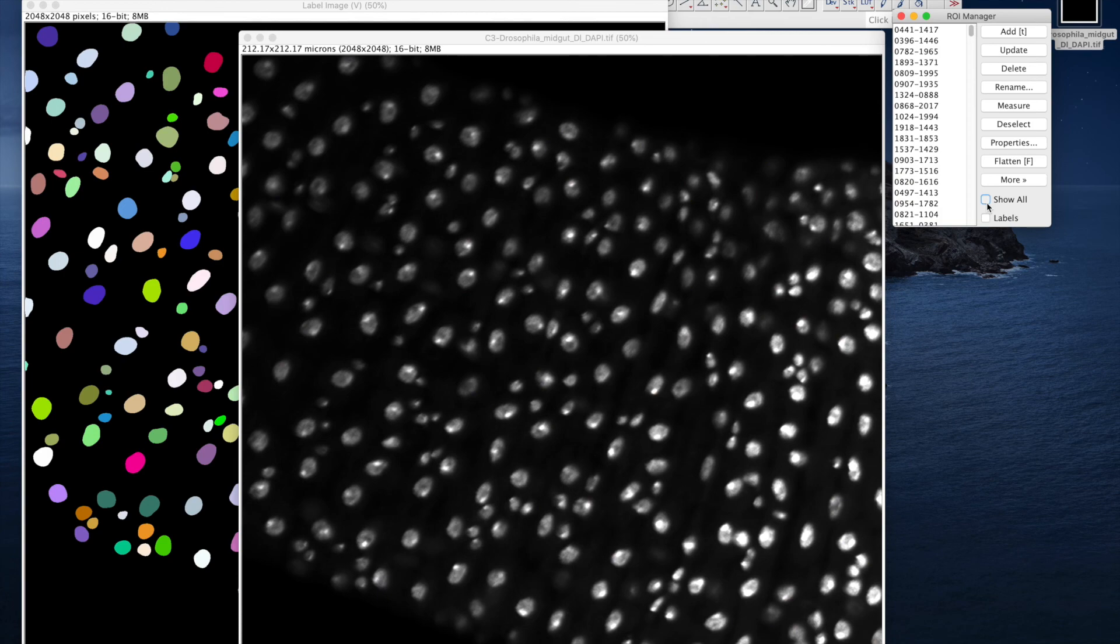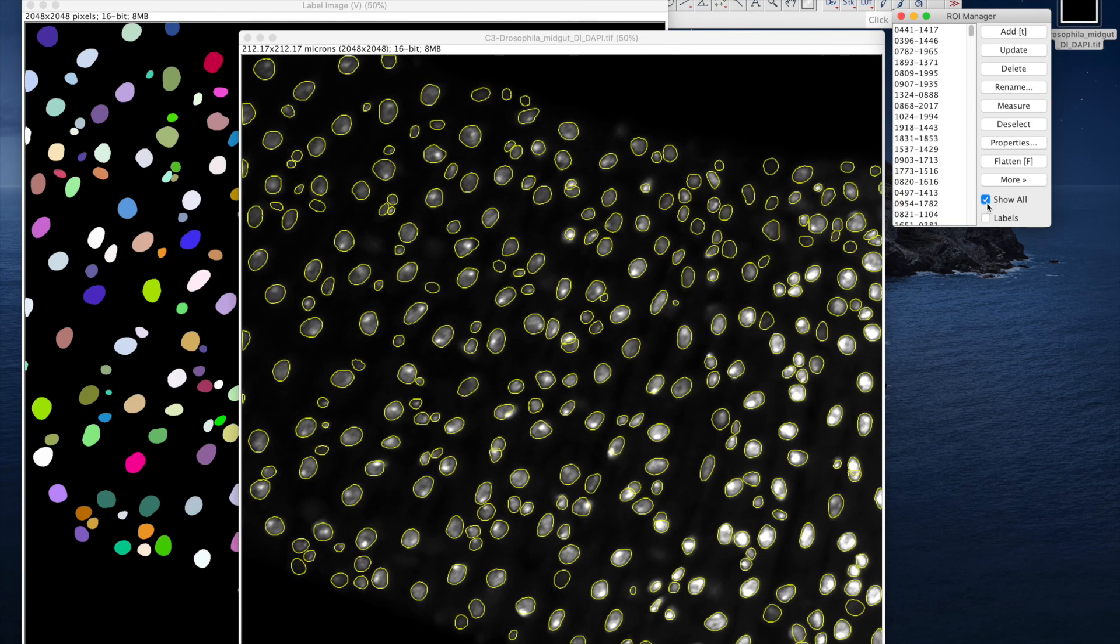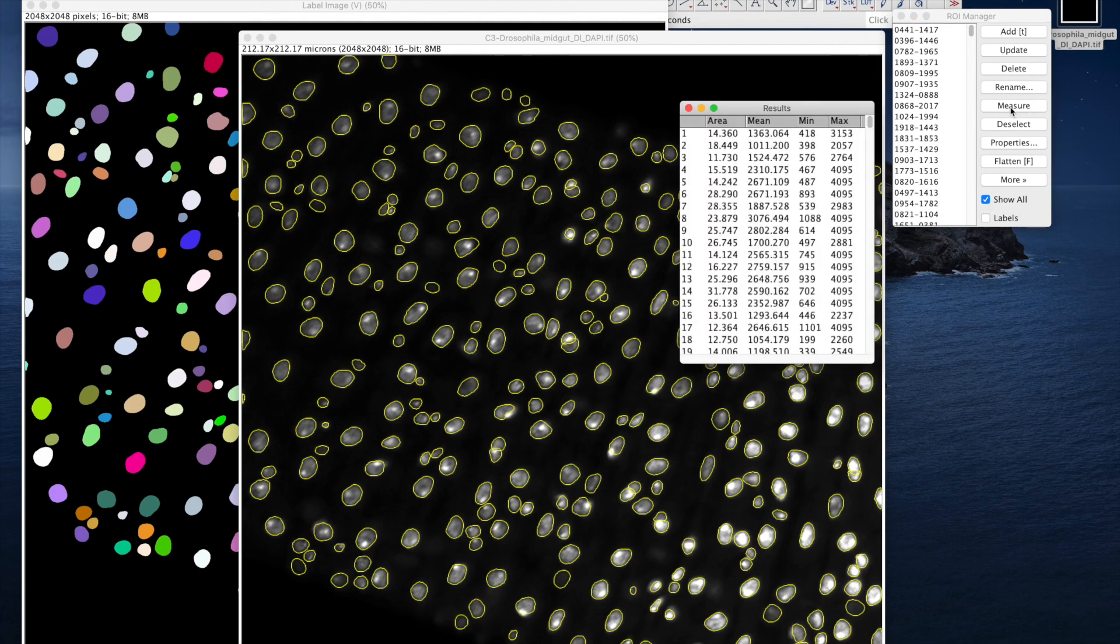The segmentation result looks great. And you can measure, say, the area of each region.